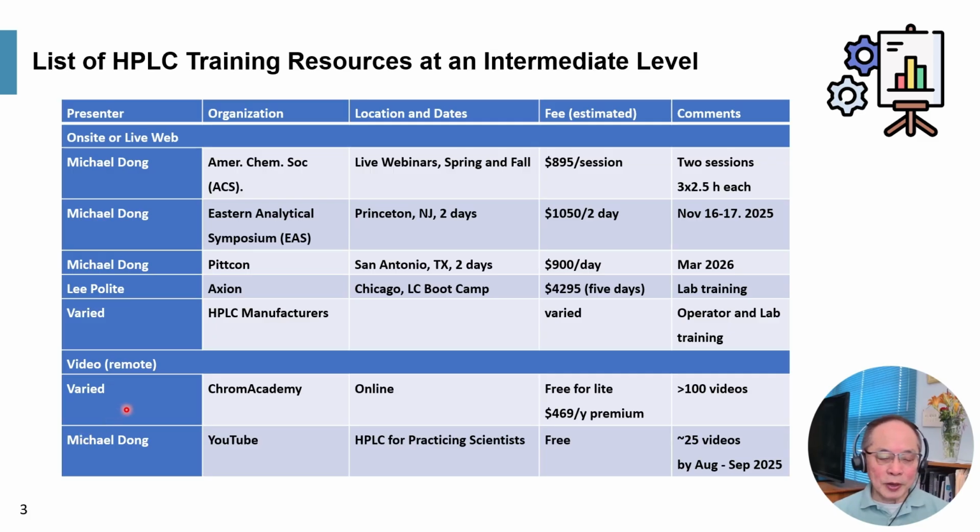One of the most prominent ones is Chrome Academy, which offers online training, and there is a free membership for light members, and also a premium membership. There's a fee associated with it. There are an estimated above 100 videos on this site.